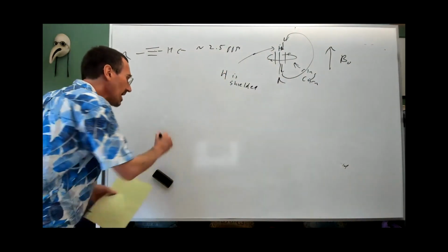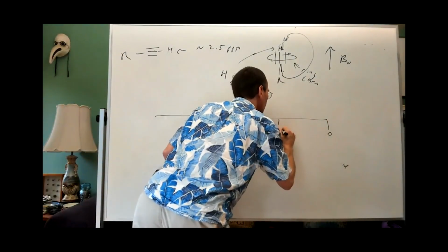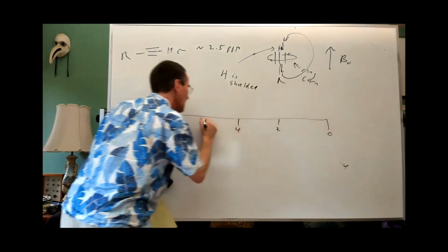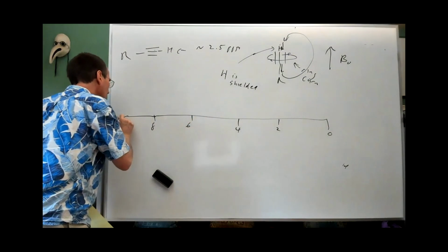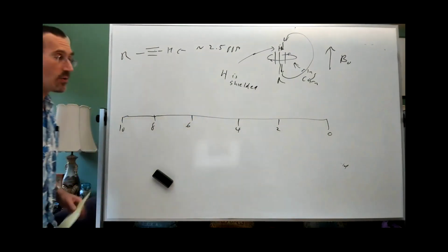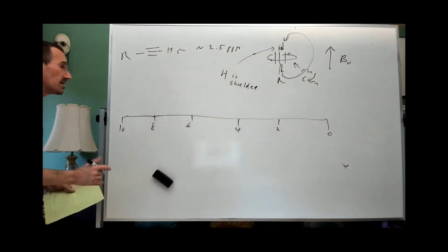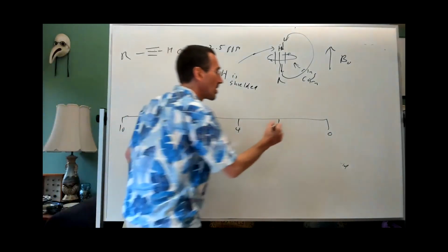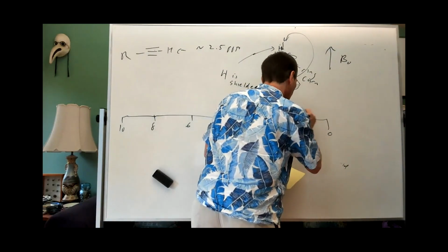All right, last thing I want to say, because I know I've run way over. I think analog. I read a spectrum and I read it analog. And so in my analog mind, I keep this in mind, that we start over here at the upfield region of the spectrum.